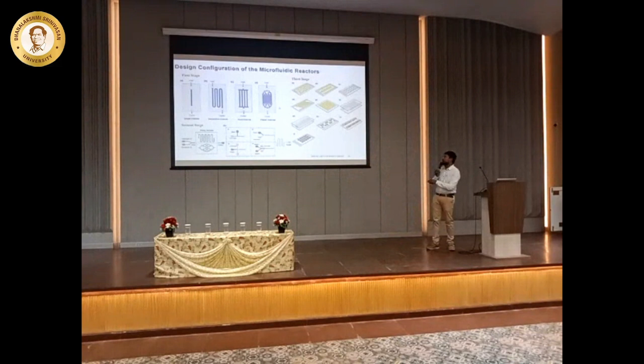And these are the different stages with which you want to mix it. Now we are making much more rapid mixing when you have these structures. Because a ball has to travel this way, it has to hit all the pillars. Say you have a classroom of 50 people and you want to travel from this point to another point. Obviously you will hit at least some 10 people there. So this is what is happening here. Again, we are having a mixing property here. A single stirring mechanism can be brought out in different structures of microfluidics that we want.